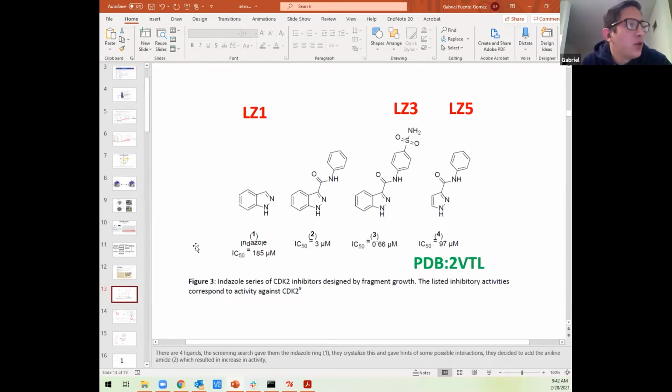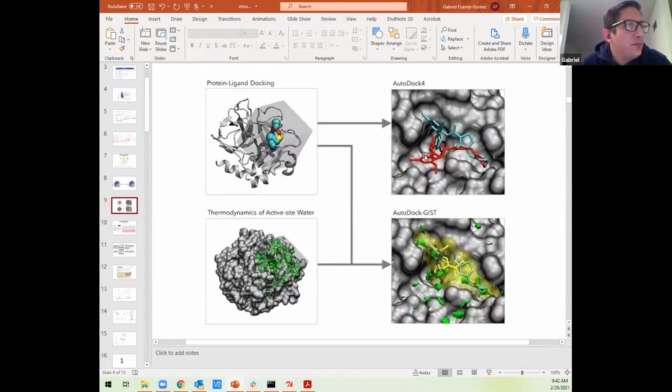So what you're going to do is, after doing the docking, you see there are 2 different positions, right? There is the blue one and the red one. After doing this analysis, you find that, for example, this is a nitrogen that could be forming a hydrogen bond with another residue in this site.